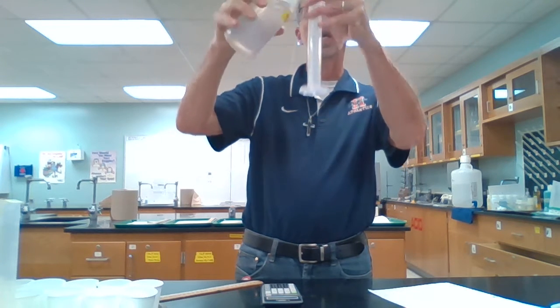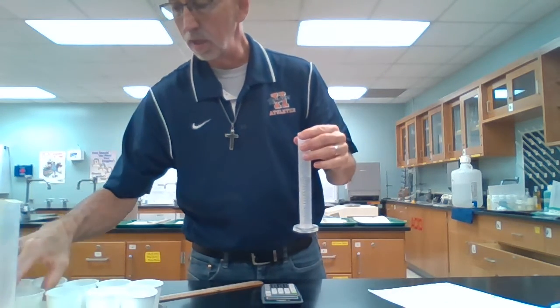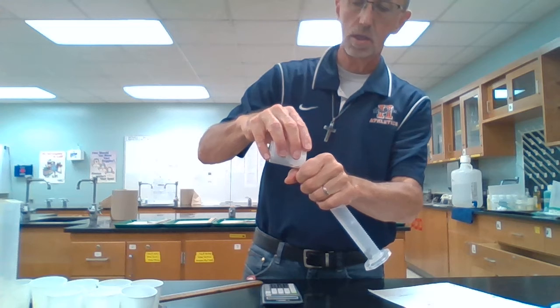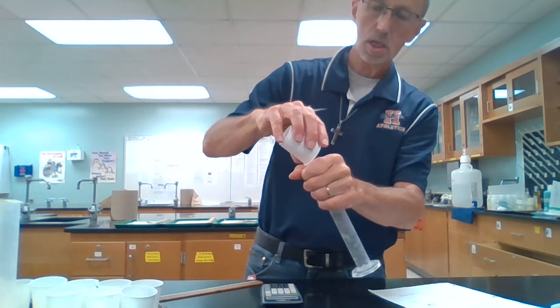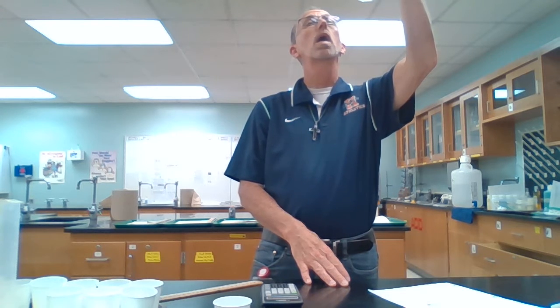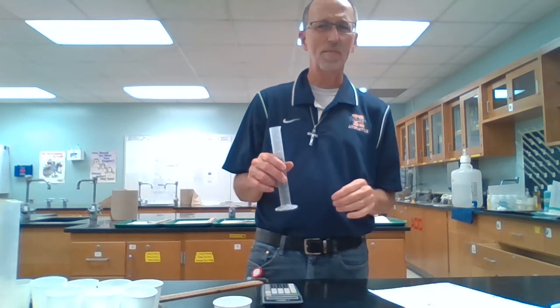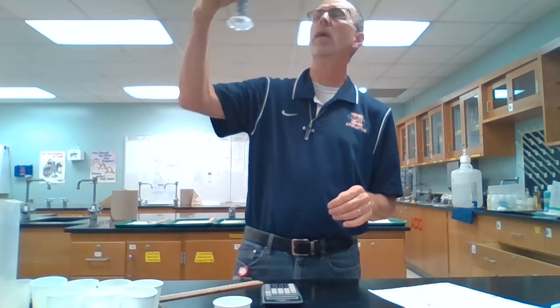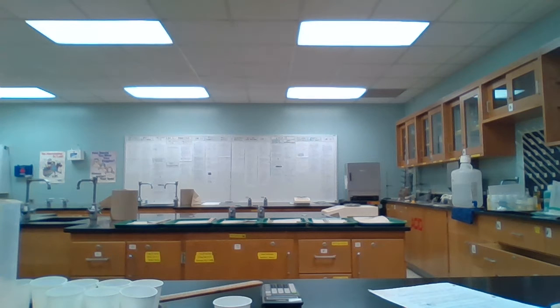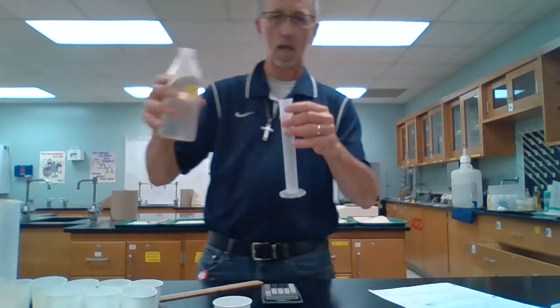Water back in there again. Make a mental note of that volume. Here's number 4. It looks like we went up about 5.5 mLs. And number 5.